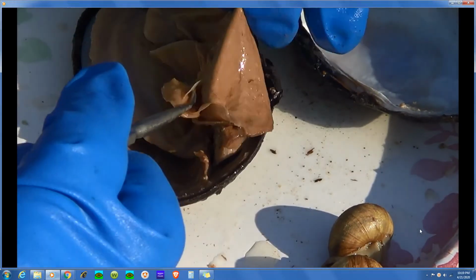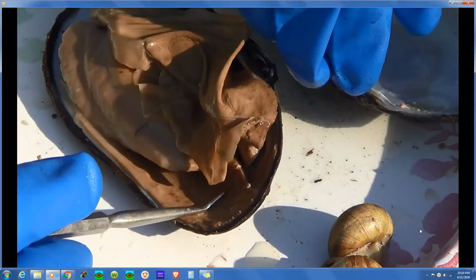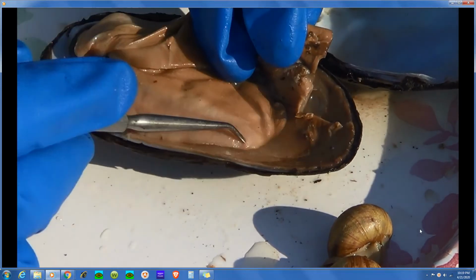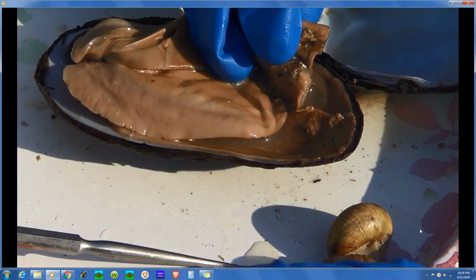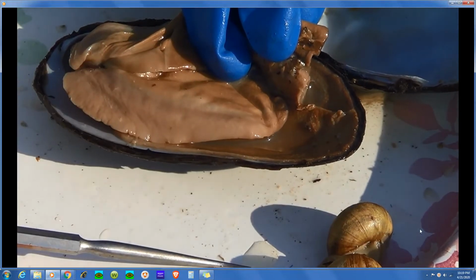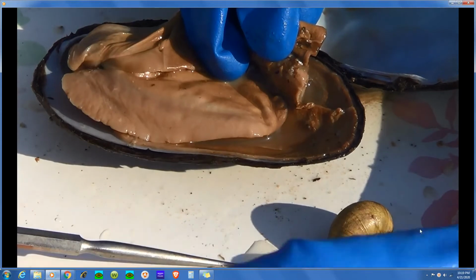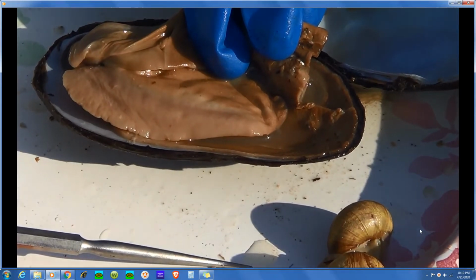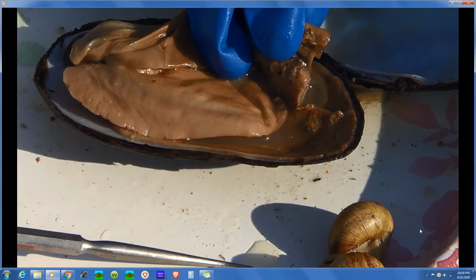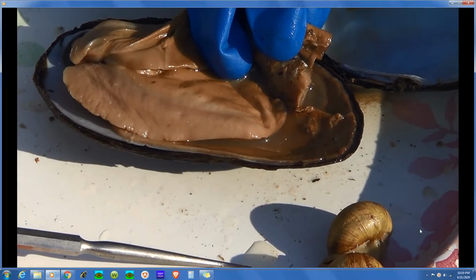And for the sake of keeping this fairly simple, I'm not going to do too much inside of the animal. These particular animals, there's not much to see inside, but one thing that's worth seeing is that they have an open circulatory system. Now, what you won't really be able to see that, but it's worth bringing up.